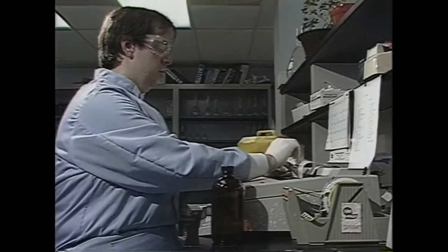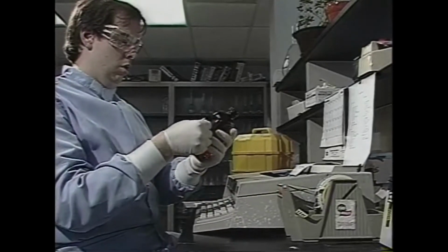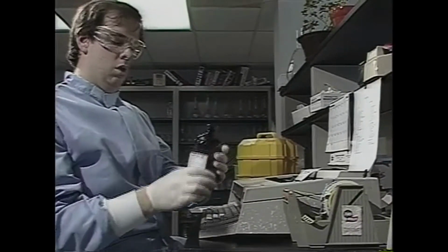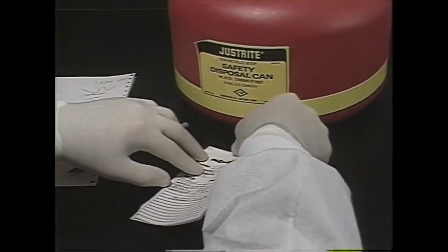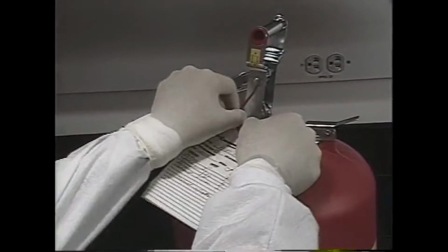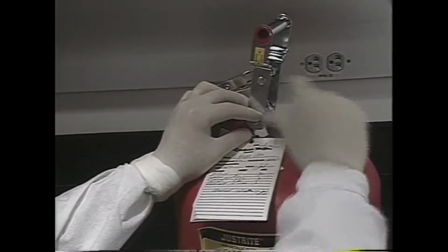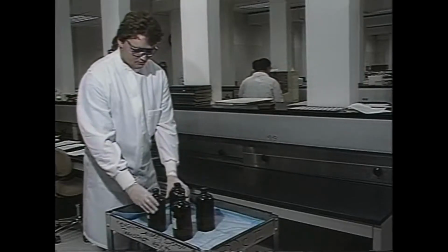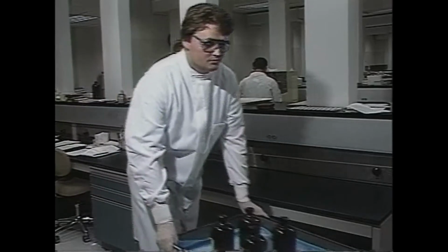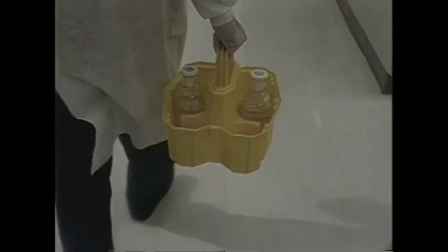And remember, anytime you transfer a chemical to another container, it's your responsibility to label that container as well, so everyone else will know what's inside. Your facility probably has a standardized labeling system for these secondary containers. All chemicals need to be handled with care, but hazardous chemicals demand an extra degree of caution. The protective measures we should take depend on the hazards of the material.